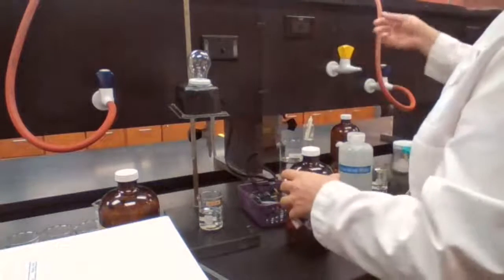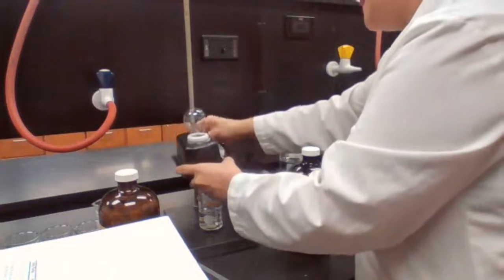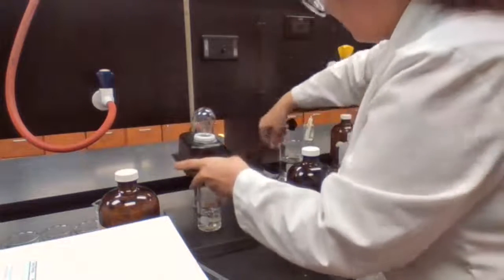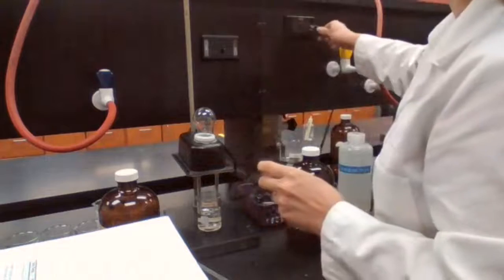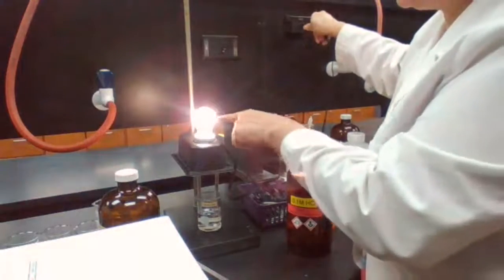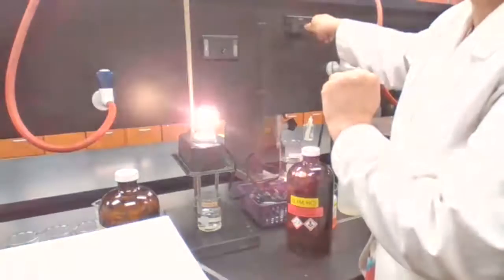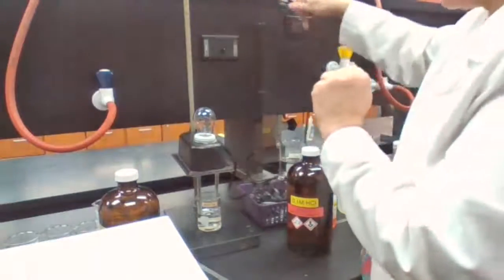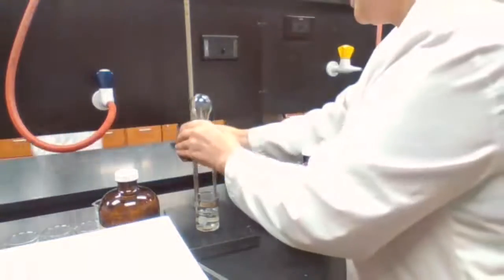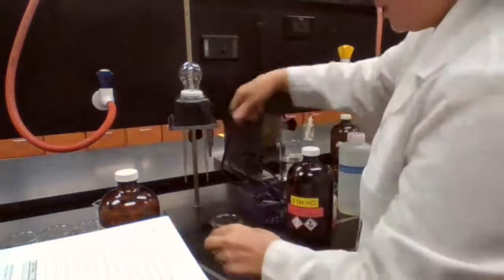Is it a strong acid or weak acid? If you know HCl is a strong acid, then you can answer the question even before testing. Strong acids are strong electrolytes, and strong electrolytes give bright light. So HCl is a strong electrolyte and gives a strong and bright light.